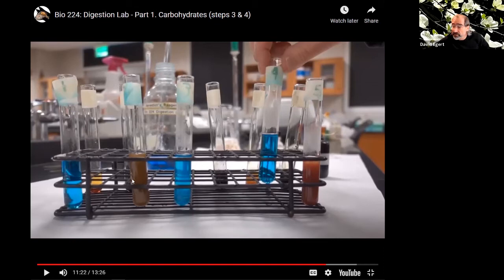Over here, we can see, because a positive Benedict's goes anywhere from green to red, on tube 2 this is also a pretty dramatic positive Benedict's, meaning what is present in tube 2 that Benedict's is telling us?